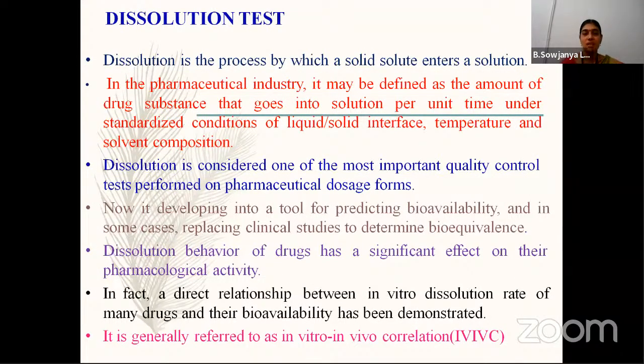So the next one is the dissolution test apparatus. It also plays an important role, and here the tablet should be disintegrated into smaller granules. Whatever granules enter into a solution, the fine particles are completely solubilized or dispersed into a given solvent system. So dissolution is the process by which a solid solute or solute molecules enter into a given solution.